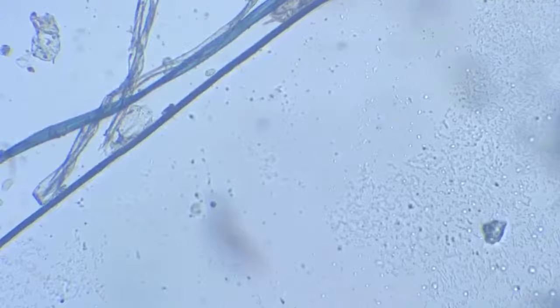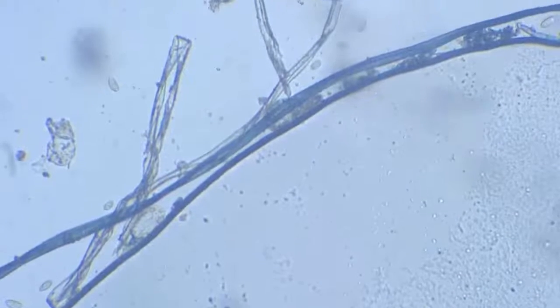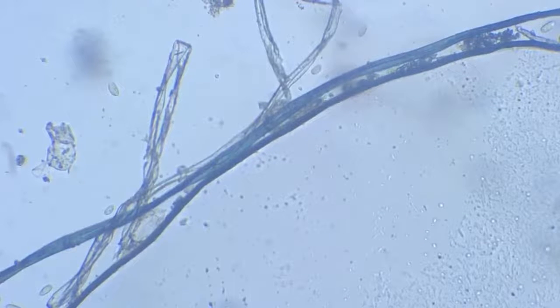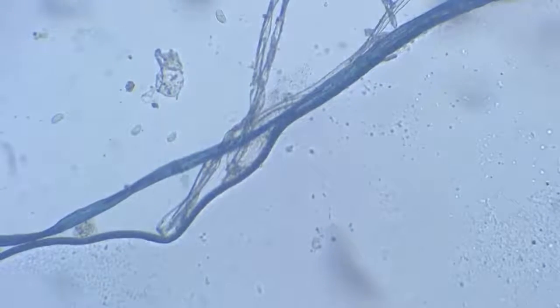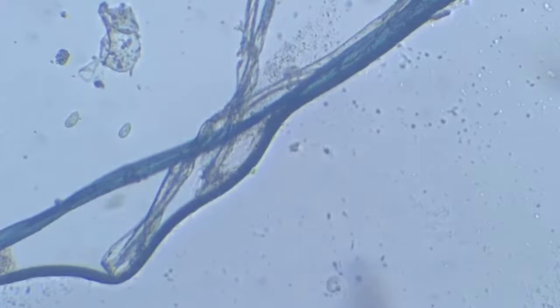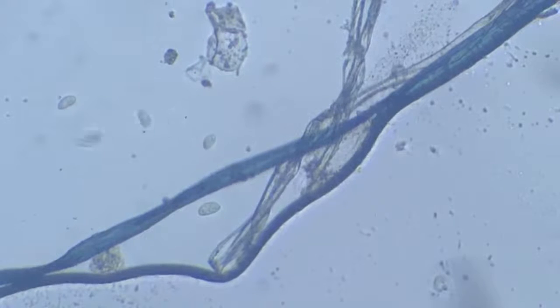That euplotes is trapped. It's hardly in a position to move. Both of them are shrunk. They can't even move, and the struggle is on. And so are the euglenids. A few have escaped to a nearby place, but finding nothing there, they are stuck. They can hardly even move. We'll quickly focus on them.